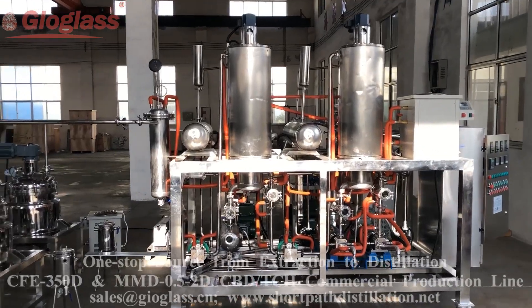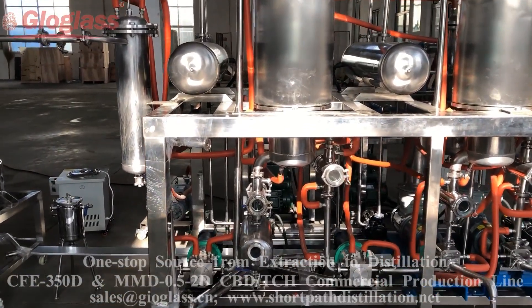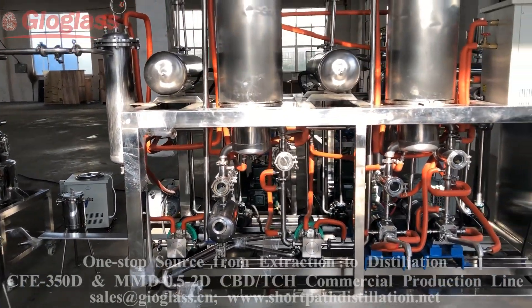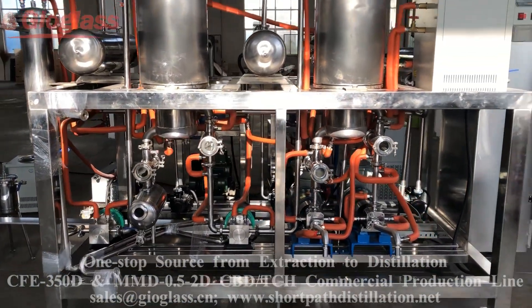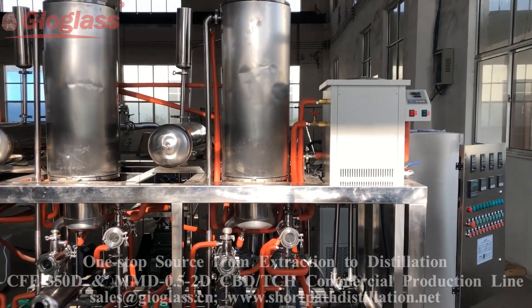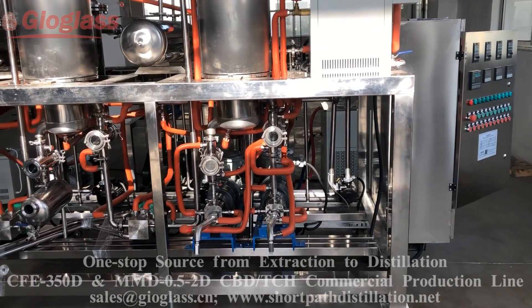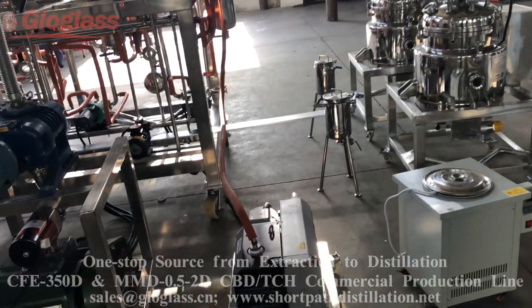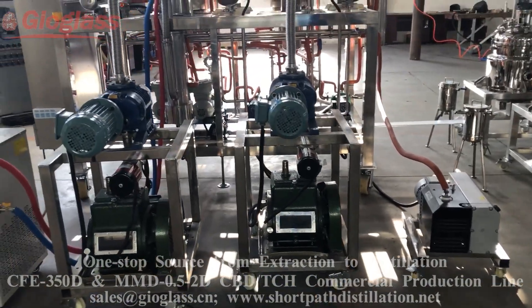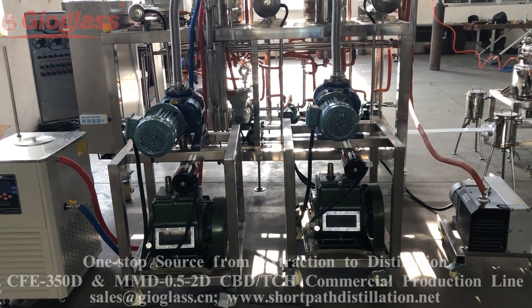The first stage is the short path distillation stage. The main function is to remove the terpenes in the cooled oil. Then it is pumped into the second stage to do the decoloration and remove the impurities. The vacuum system here uses a roots pump and an oil pump.